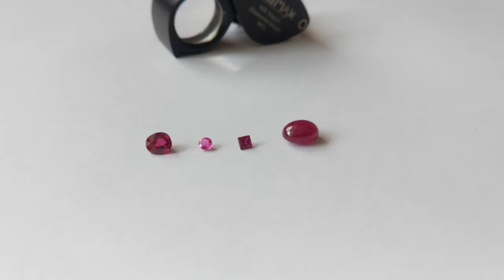So based on your naked eye just by looking at these four stones, one cannot tell if a stone is synthetic or real. I have seen a lot of videos on YouTube which explains that the rubies could either be synthetic or real by just looking at it and seeing if it's clean, nice red, pigeon blood, etc. But that's an old wives tale.